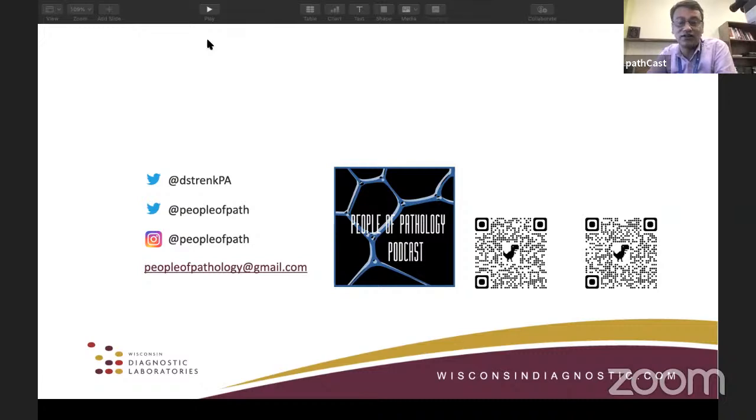Because as we all know, the number of lymph nodes is so important and so vital. How many lymph nodes are positive, or if positive, that really determines the patient's further treatment. So even though it is a tedious process, lymph node dissection, and more than that, designation in the cassettes about the lymph nodes is really very important, as Mr. Strenk has mentioned.